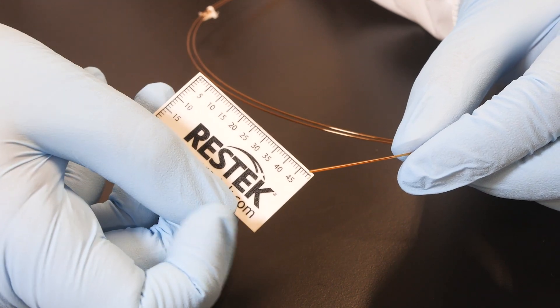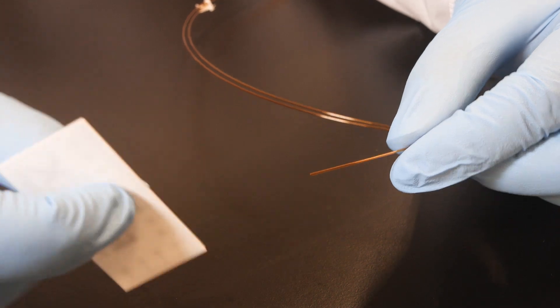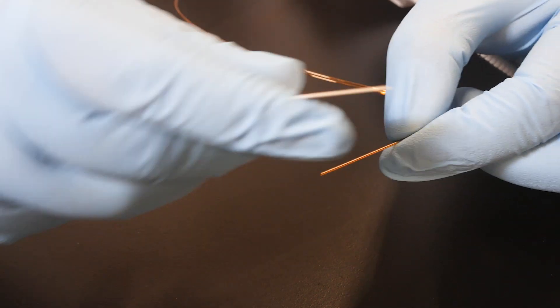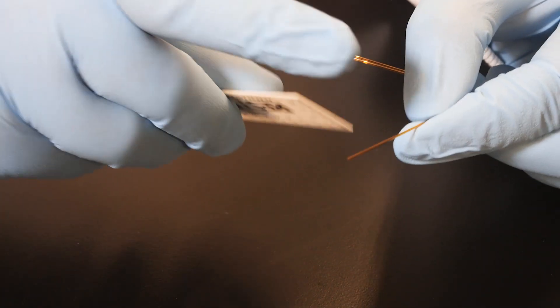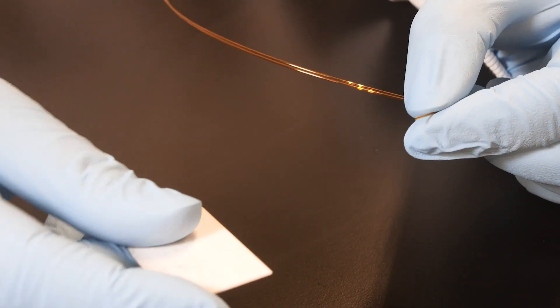Now that the conditioning is complete, it's time to cut the end of the plot column and the particle trap column. A scoring wafer should be used to achieve a straight, square cut, which is essential to correctly connect the press-tight connector.